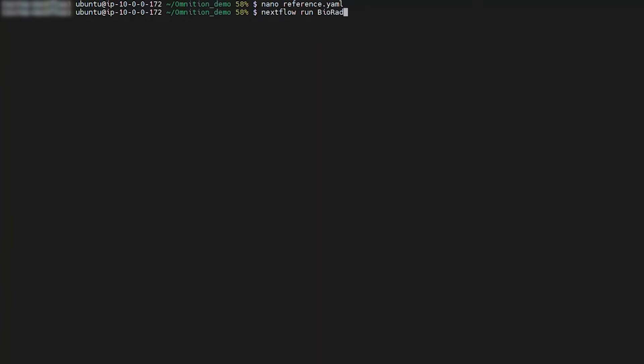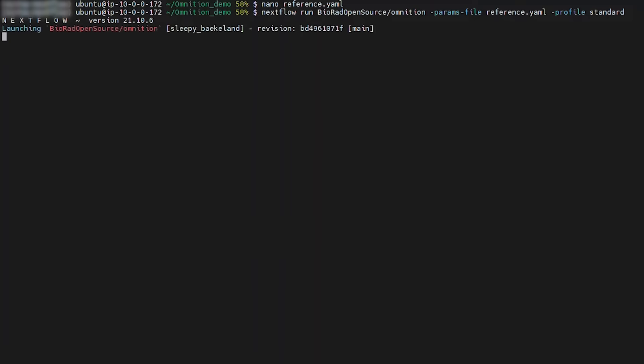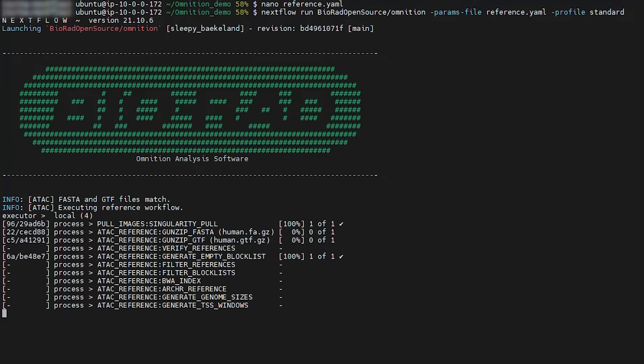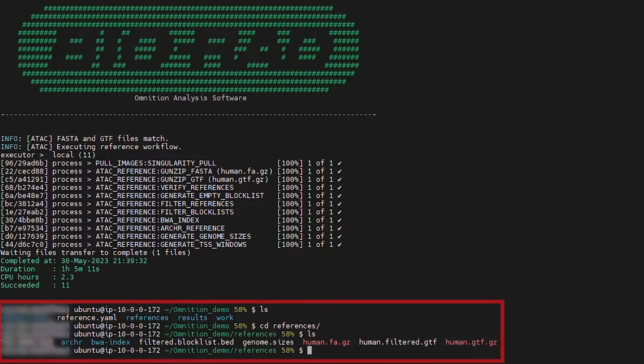Once the YAML file is saved, users can start the reference workflow by typing this command in the command line after navigating to the directory where they would like to have the files stored. Once you hit enter, the BIO-RAD logo will appear and Omnition will begin running. The time it takes Omnition to run will depend on how large your input files are and your computing power. Once the reference workflow is completed, you'll find all these reference files in the folder that you started Omnition in.